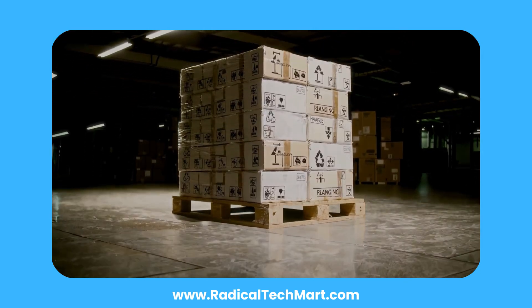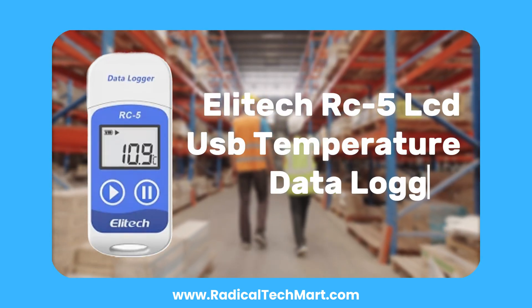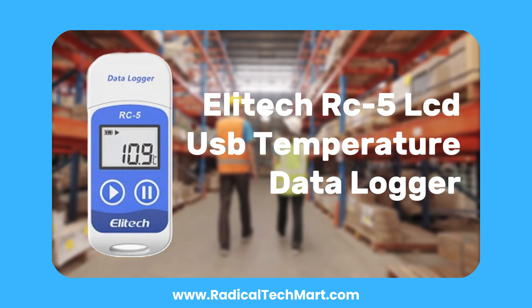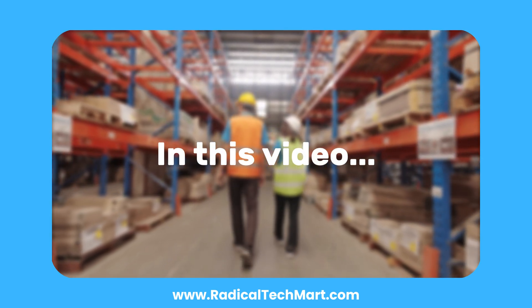Are you looking for a simple and cost-effective way to track temperature in your cold storage, medical transport, or warehouse environment? The Elitec RC5 series is a compact USB temperature data logger that makes monitoring easy — no special software required. Let's dive into what this device offers and how you can set it up in minutes.